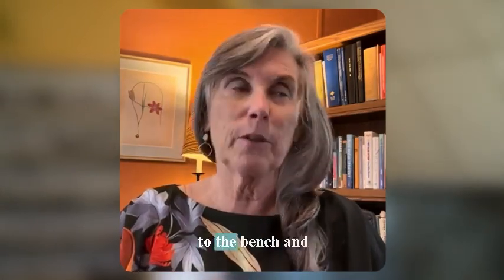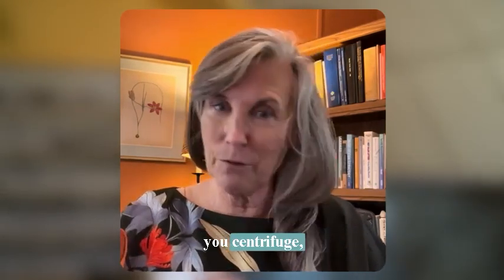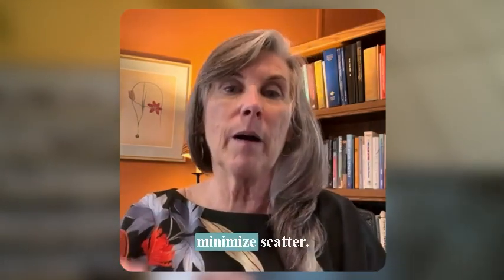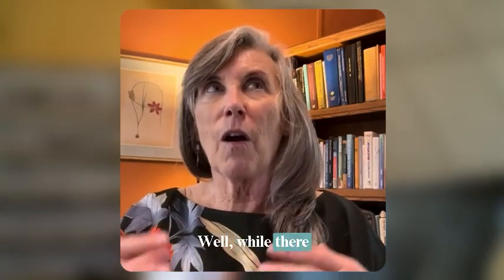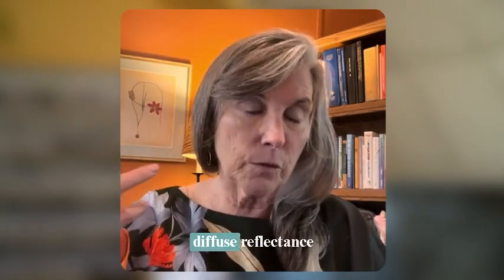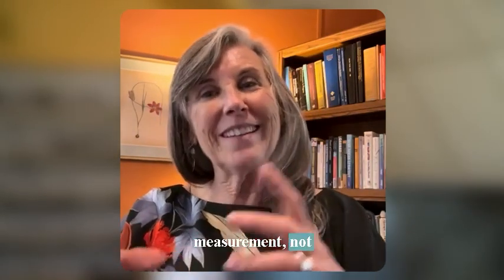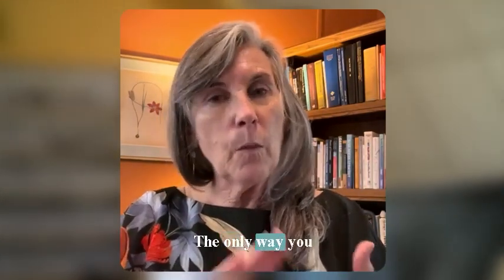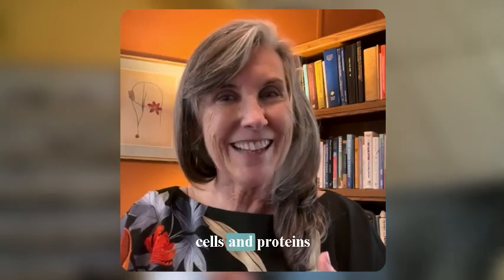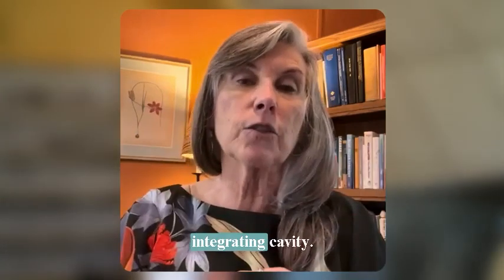And so you go back to the bench and you clarify more, you purify more, you centrifuge, whatever. You dilute, you do what you can in order to minimize scatter. Well, while there are existing technologies to help you around that, and I'm thinking of diffuse reflectance in particular, diffuse reflectance is a reflectance measurement, not an absorbance measurement. The only way you can truly work with a suspension, including whole cells and proteins in them, is with a technique called, or a little device called, an integrating cavity.